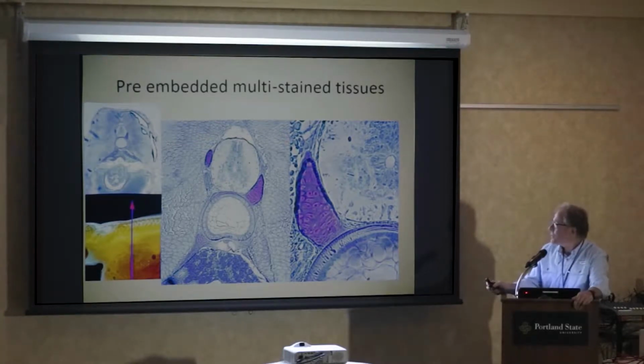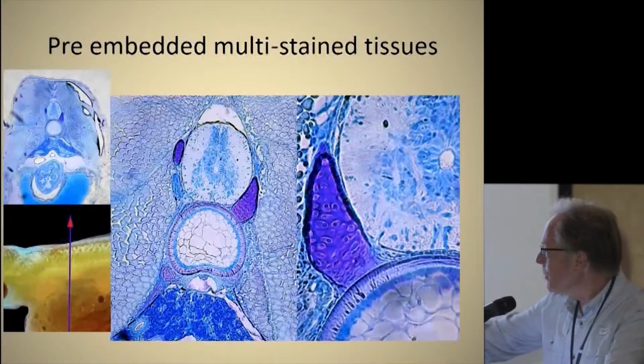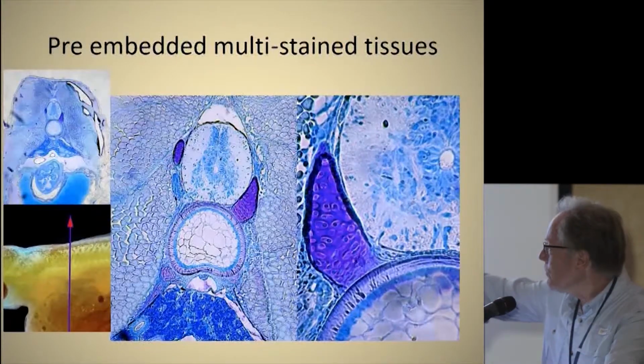Now, before I go into this one in cross-section, you saw the trout earlier. This is just a close-up view. This will be sectioned right through the yolk reserve, the yolk sac here, through the foregut, up through the neural tube, and then the cross-section will look like this.